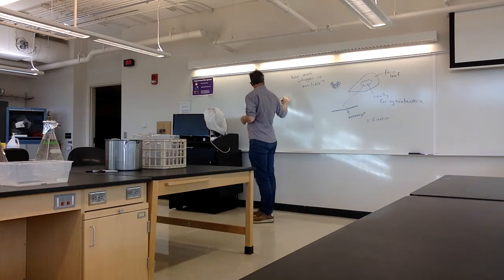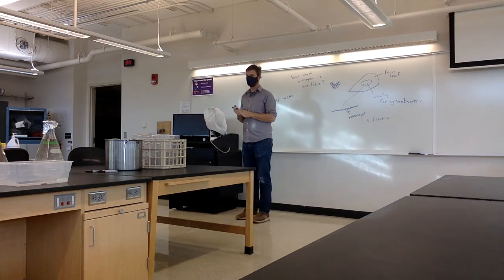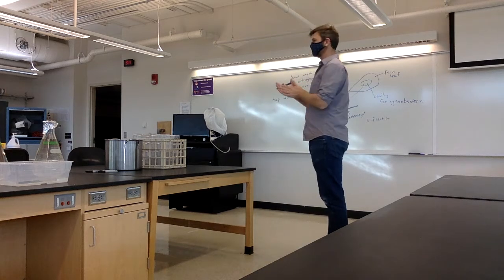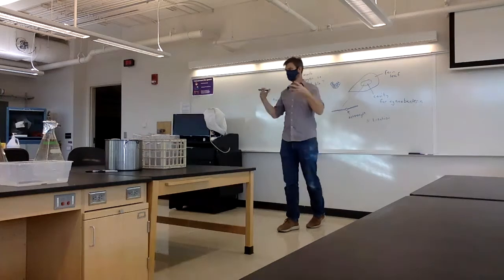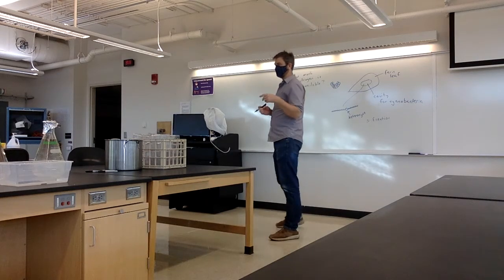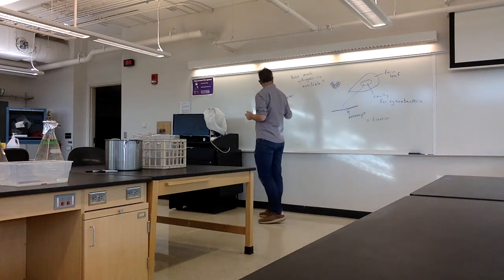and they're all based on tap water, so we're not doing a sterile environment. Trying to get things sterile, I think, is a little bit extra layer of difficulty for us that we don't need to worry about. I don't think there'll be big contamination for anything. I guess we'll solve that if we get there. And the tap water will be a little more balanced osmotically for just nutrients, background salts, and so on, as opposed to deionized water where we might have to add all the nutrients we need to get that up to speed. I do have water that we added some extra nutrients to.